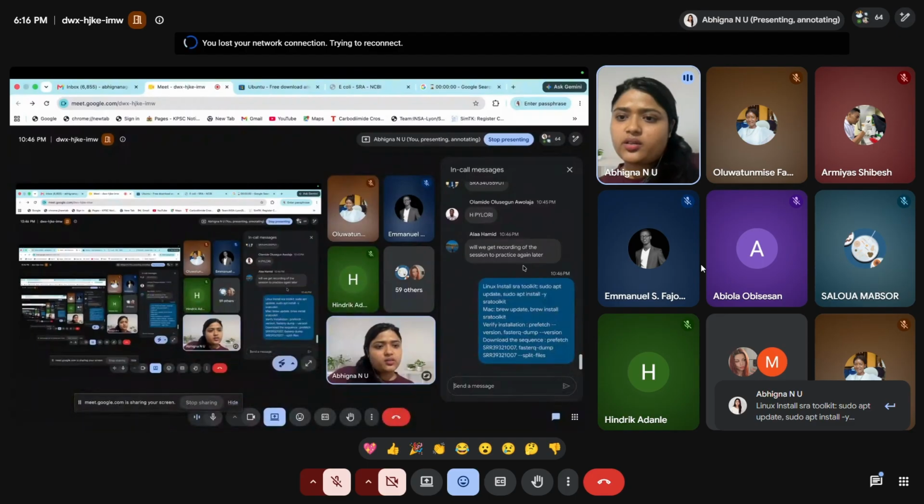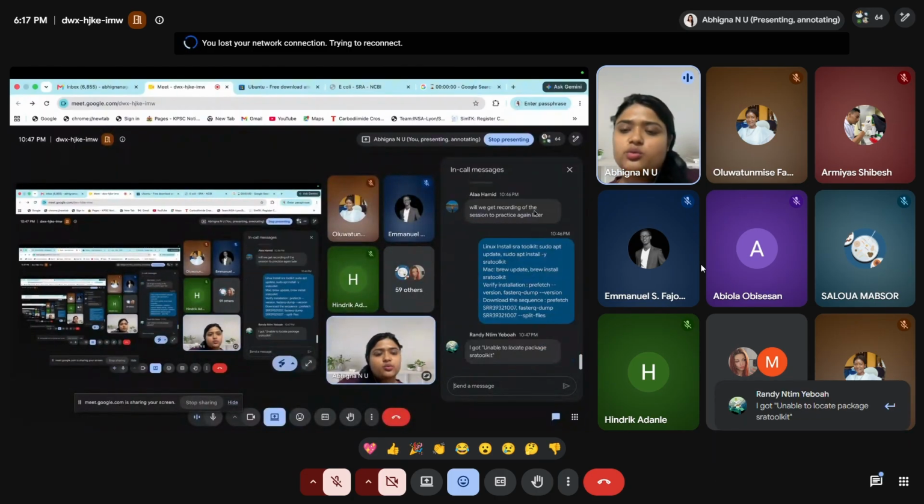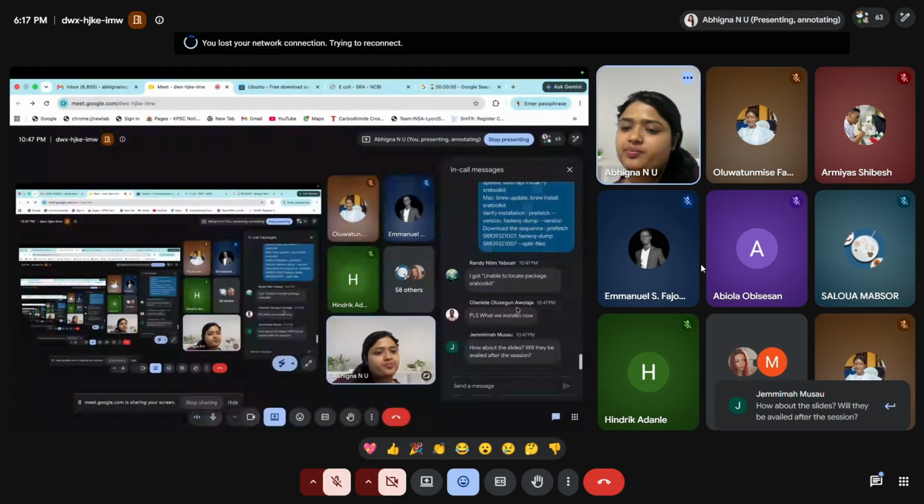Will we get the recording of the session for practice? Yes, you will be getting the recording and it will be available on YouTube as well. These are the commands you can use to download SRA toolkit. Randy, what system are you using? I mean, is it Mac or Linux or Windows? How about the slides? Yes, you will get the slides as well.